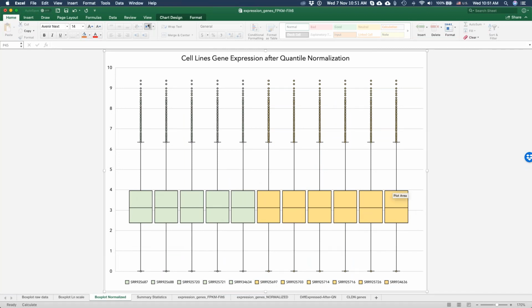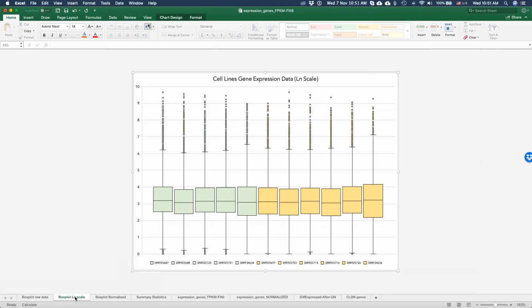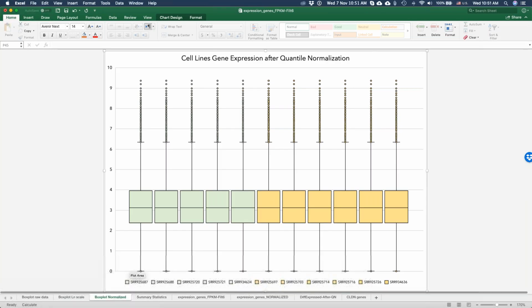Now why is this data better than this data? Well, it's better because when we compare samples and the differences between them, we want to adjust the comparison for the overall distribution of the data. And the distribution of the data could be aligned in the middle. This alignment in the middle doesn't mean that we actually change the values. We actually transform the data so that they align here, and the rest of the differences are either going up or down from this middle point.